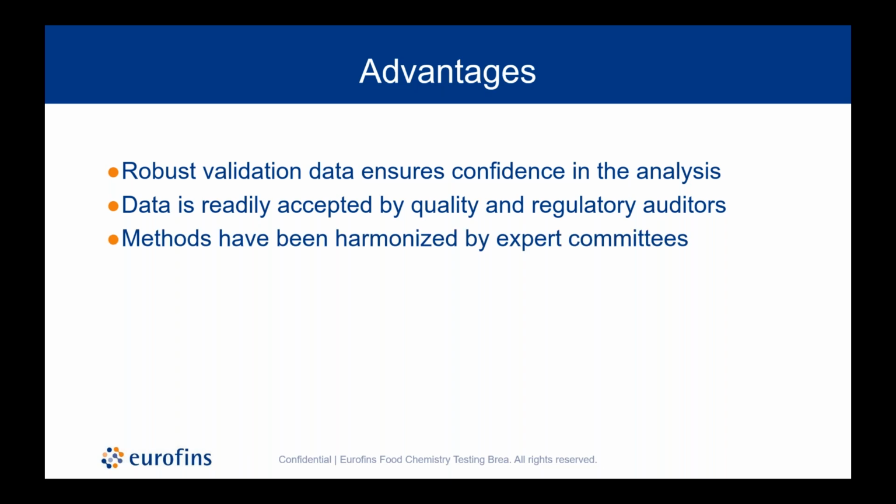The monograph methods have been harmonized by expert committees. There's been a process of peer review and comment and publishing through these authoritative reference sources. The clear acceptance criteria that are a component of every monograph method provide transparency in how we evaluate. As we walk through each of these examples, that is exactly how we would walk through our evaluation on a day-to-day basis with every test that we perform.